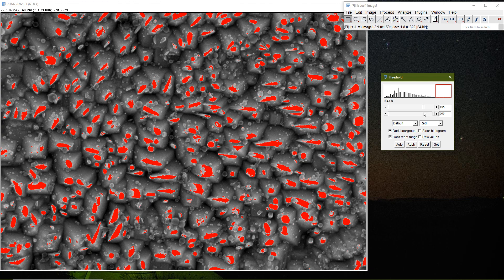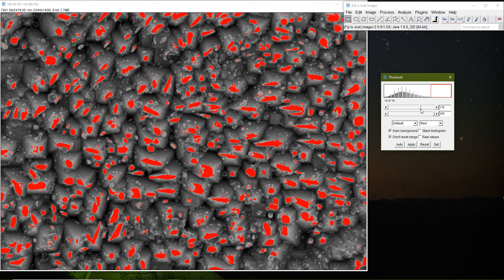There's no reference here — I just have to judge visually. I can see that some particles are not selected, some are incomplete here and there. This will give me slightly wrong results, but if we work statistically across multiple images using the same approach we will be statistically closer to the truth. There is no perfectly accurate way to differentiate one particle from another.